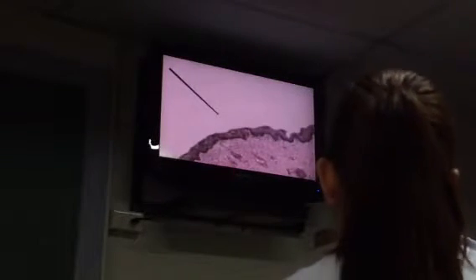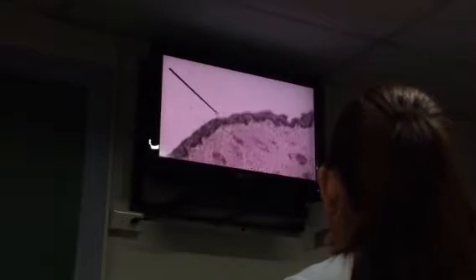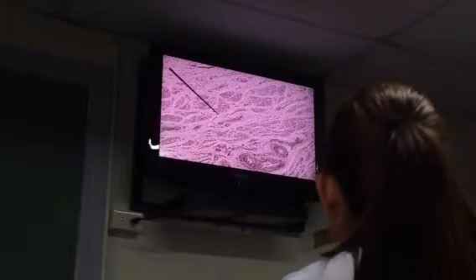And therefore, you will see your lining epithelium of stratified squamous non-keratinized epithelium. Again, in the lamina propria, you don't see any glands here. So that is also a picture that is a continuation of your exocervix. Okay? Now, notice you can see muscles here. These are, of course, smooth muscles.